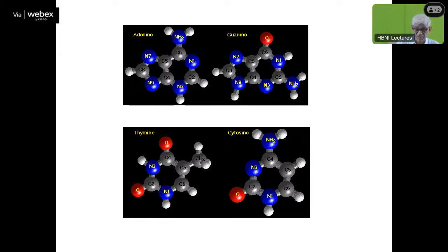You can see CH3, there are 3 protons there, whereas adenine has 2 hydrogens here, and these 2 are non-exchangeable hydrogens. The guanine has only 1 non-exchangeable hydrogen at C8, that is called the H8, and at the H2 position, here you have an NH2 group there. This becomes an exchangeable proton.